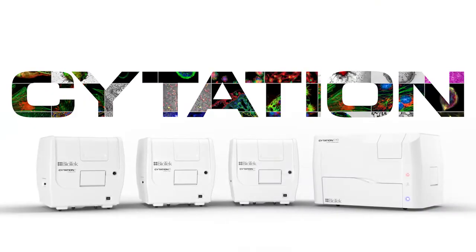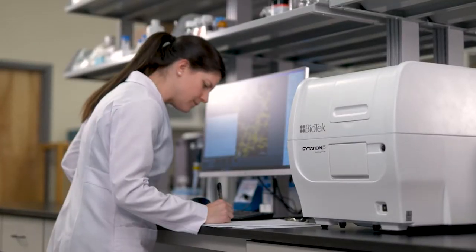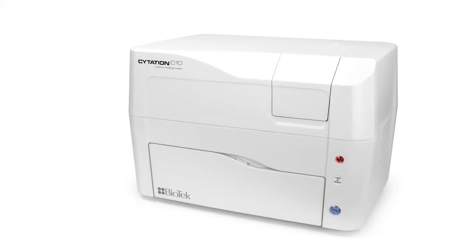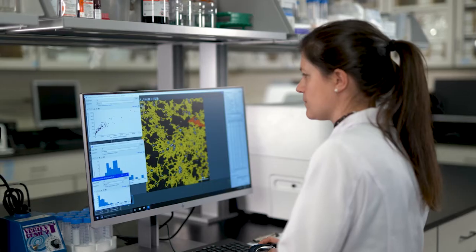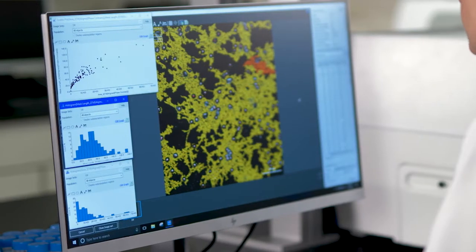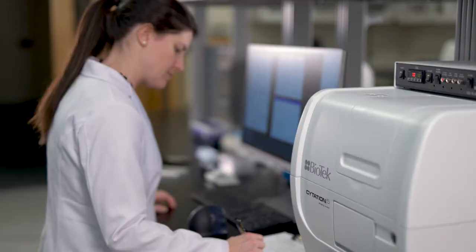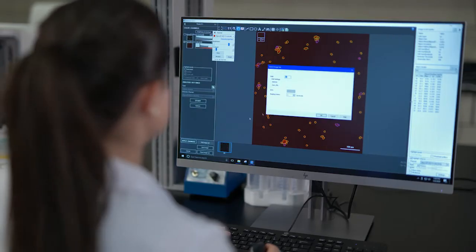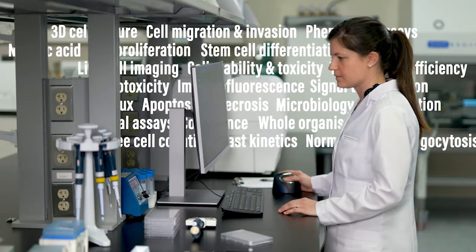BioTek's Cytation Cell Imaging multimode readers deliver performance, versatility, and reliability in a unique, patented design. And now, with Cytation C10 with confocal imaging, you can do even more. Cytation combines automated microscopy with multimode detection to capture both quantitative data and phenotypic information on a single platform. Cytation's modularity and upgradability provide for system expansion as your laboratory's applications increase. Cytation is truly ready for any assay.